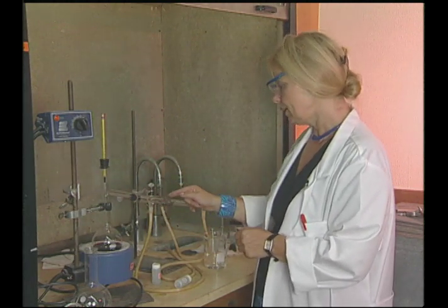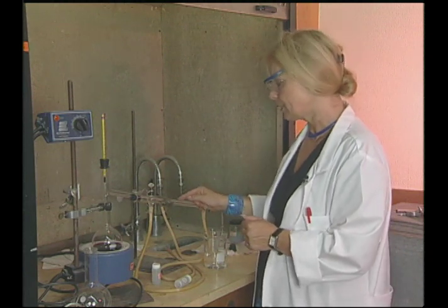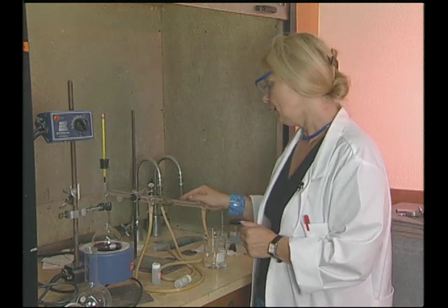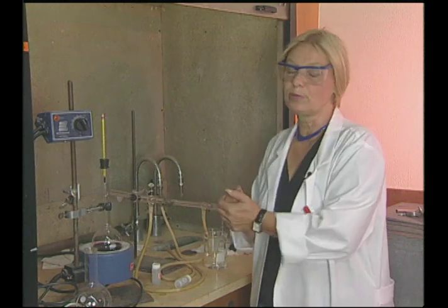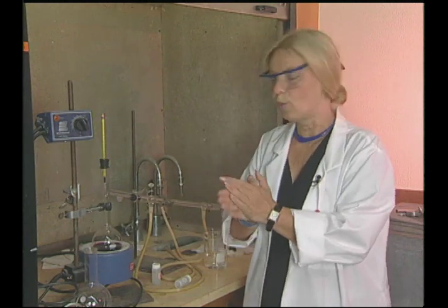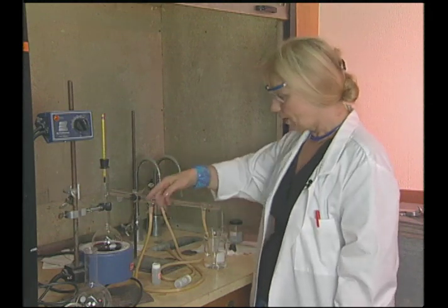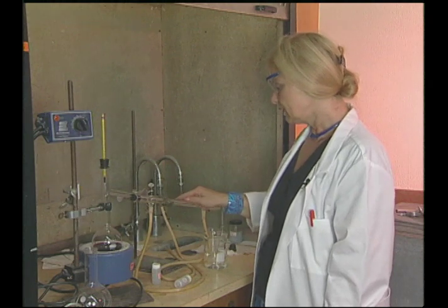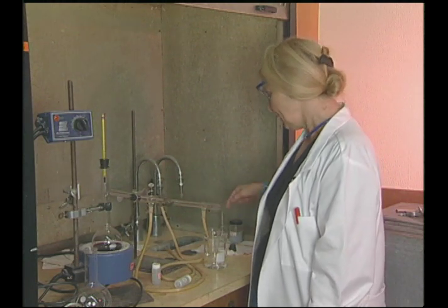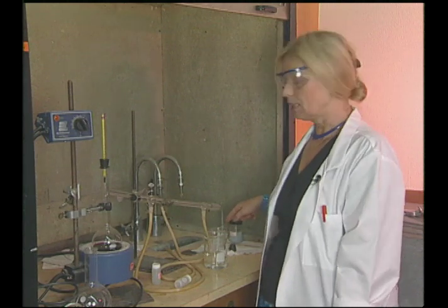this condenser, and because they come in contact, the fast molecules come in contact with a coolant liquid, which is water in the outside mantle coming from the faucet, and then they will be slowed down, and then they will go back into their liquid physical state. And later on, when this process is going on for a few minutes, we will see little droplets forming, and the dripping will be then observed into the receiving flask.